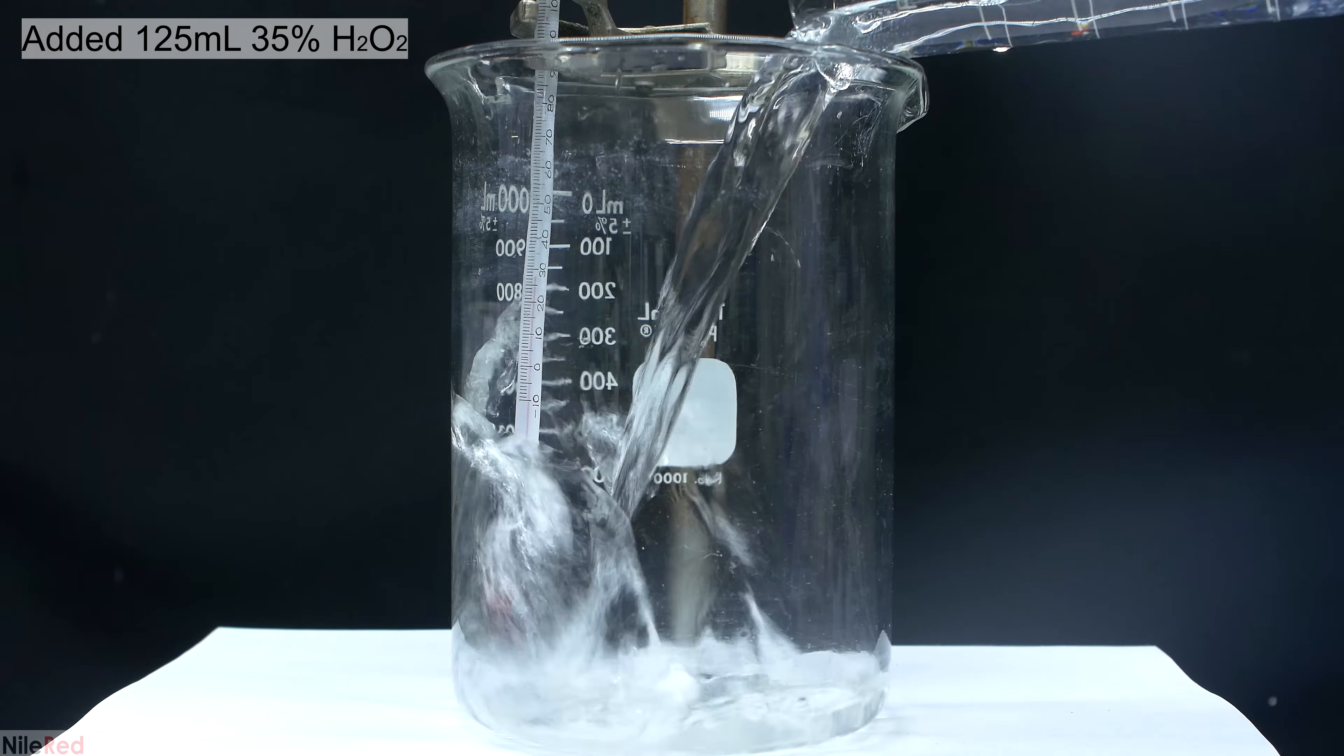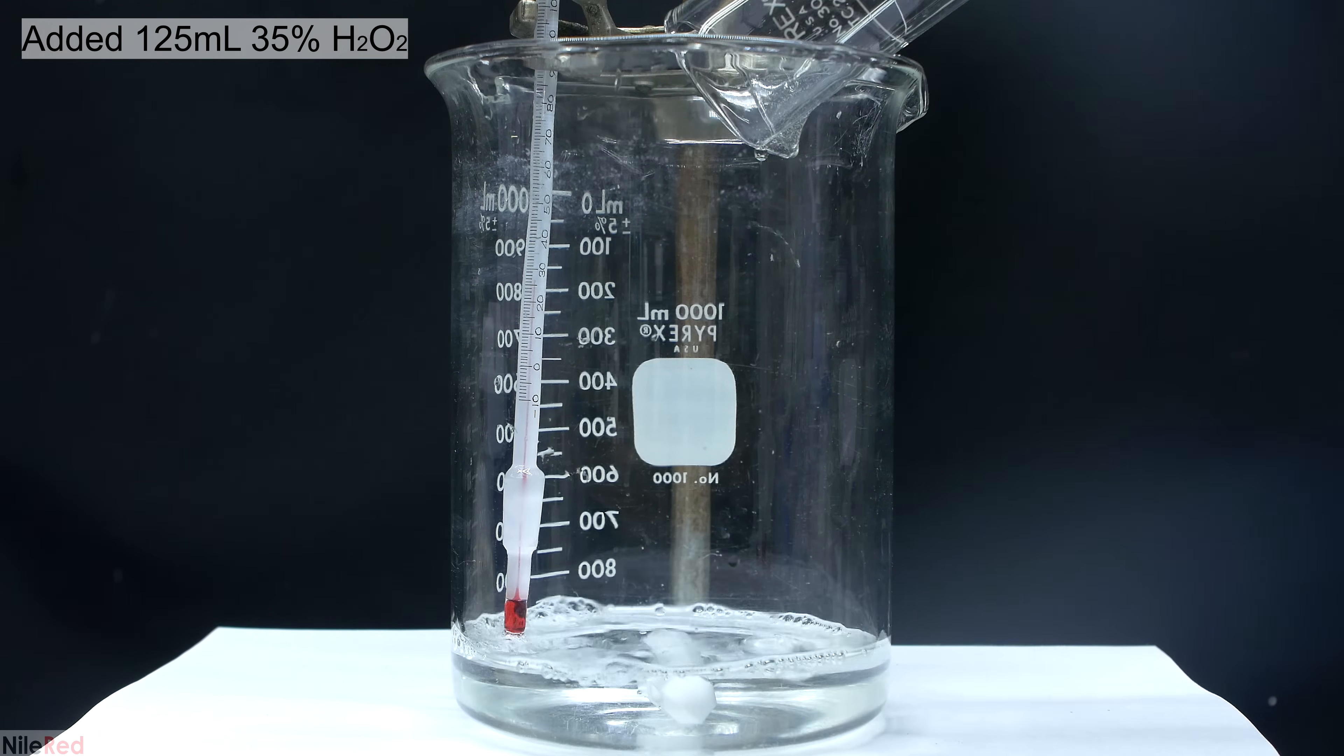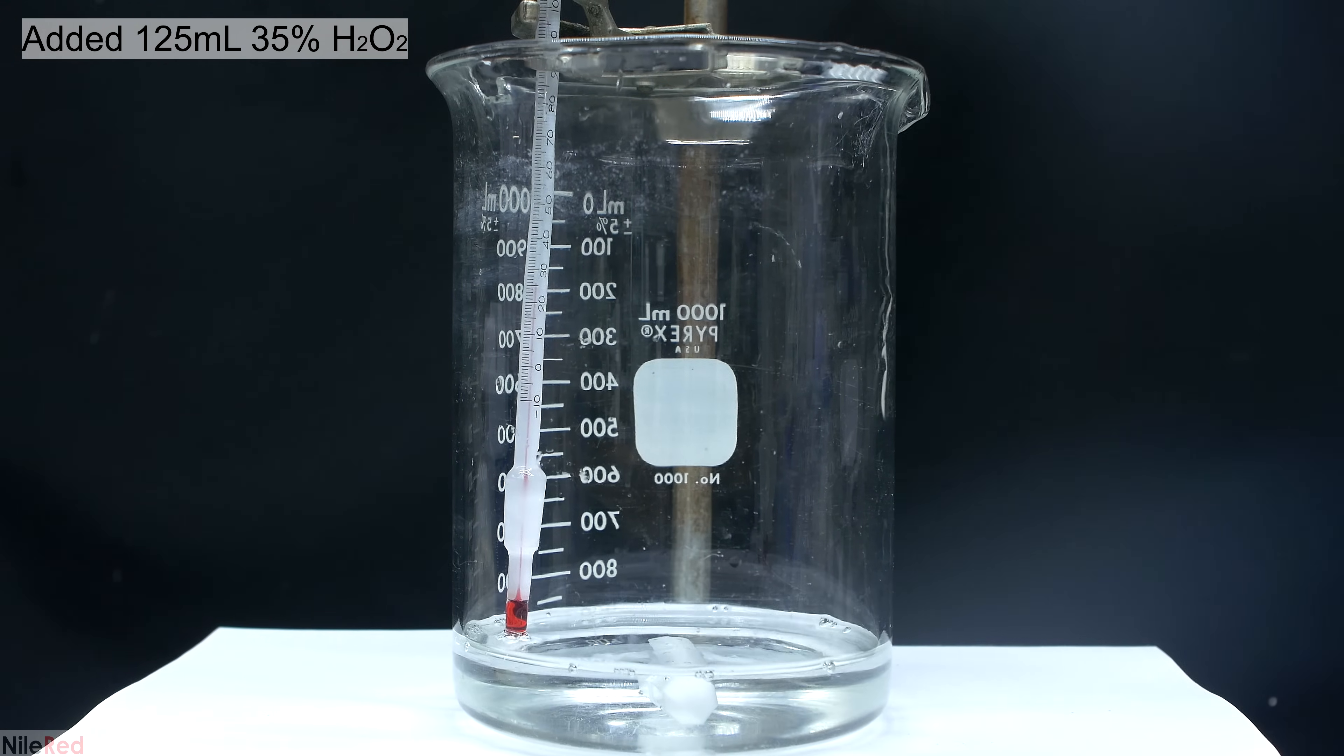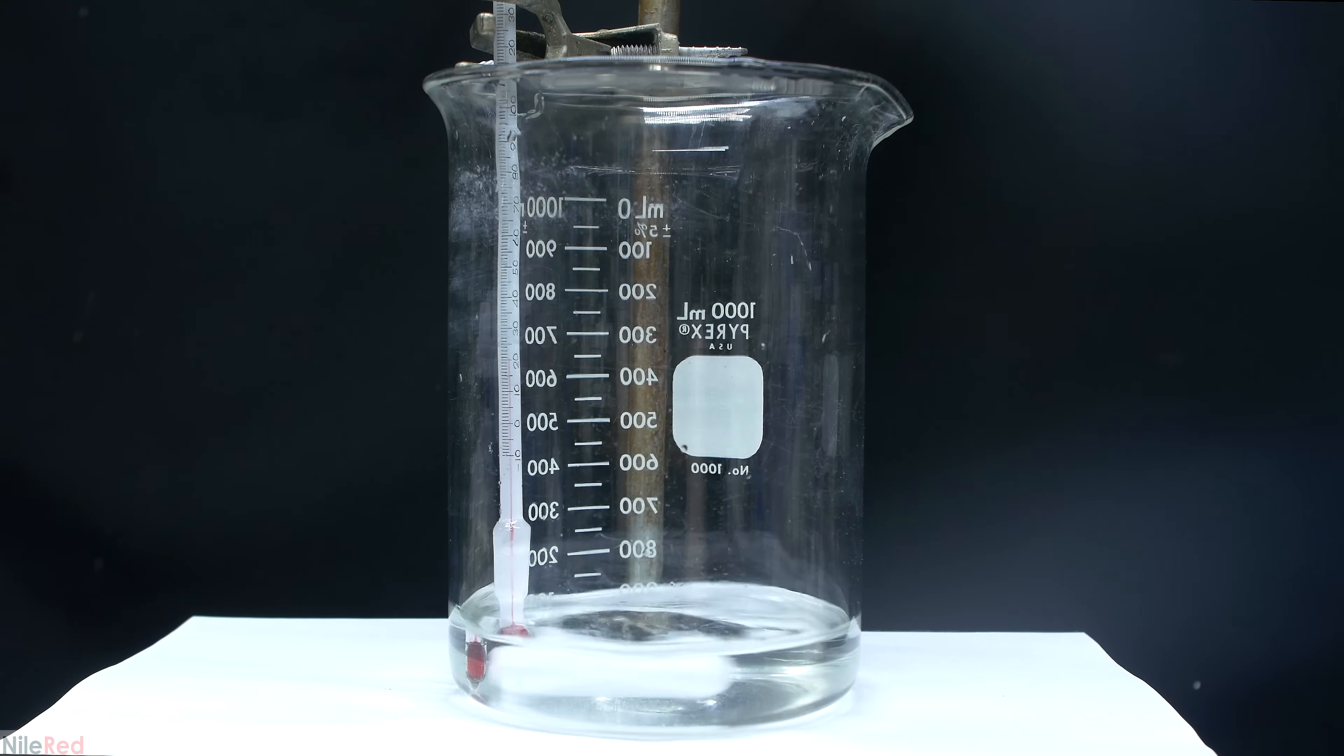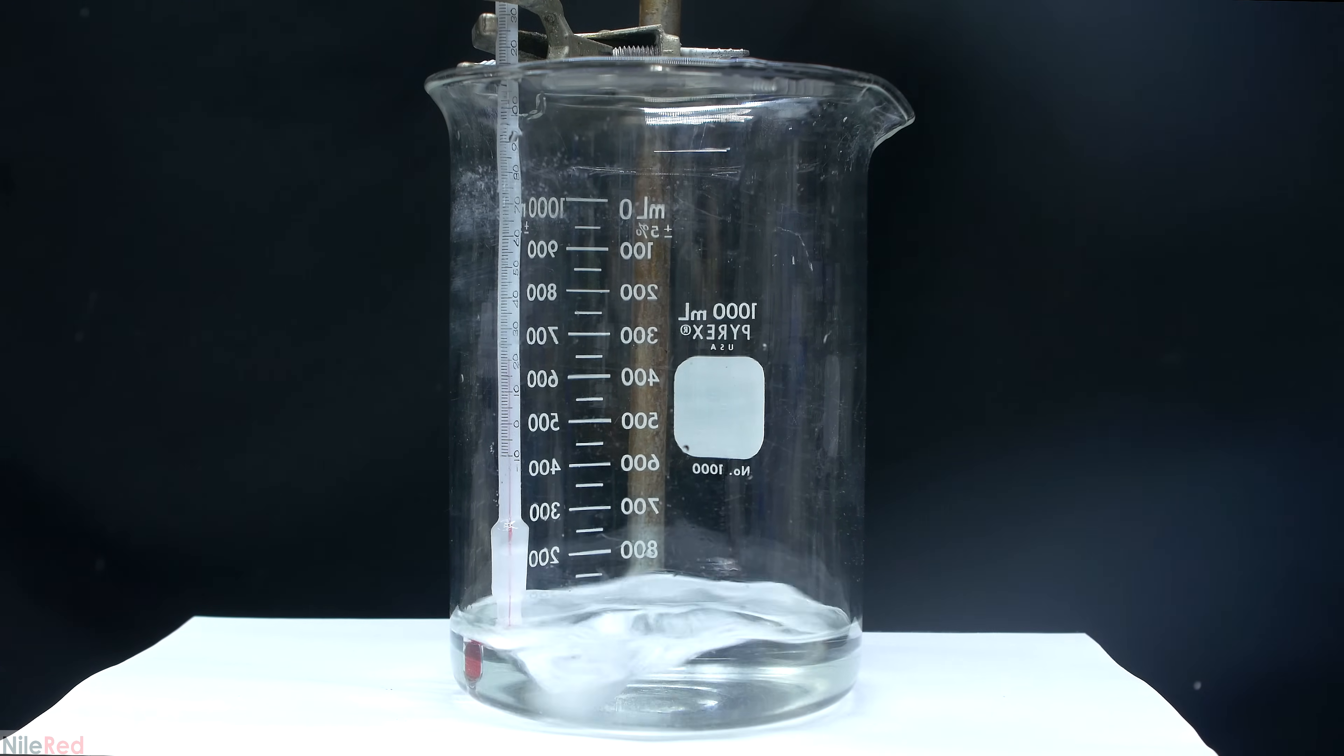To start things off, I added 125 milliliters of 35% peroxide to a beaker. The next thing that we need to do is add about 50 grams of lithium hydroxide. I turn on my stir plate and with vigorous stirring, we can start to add the lithium hydroxide.